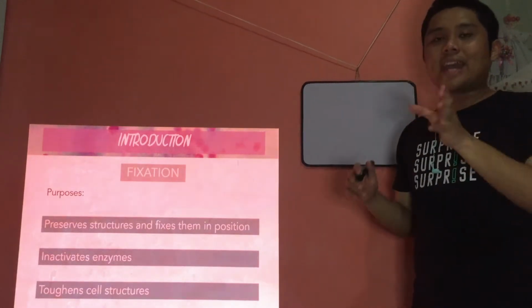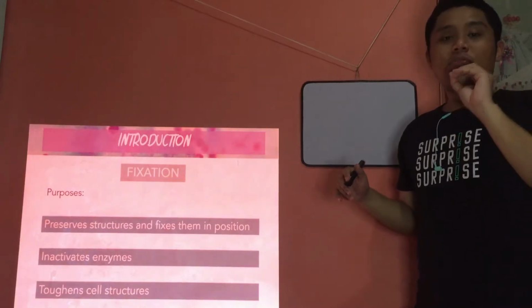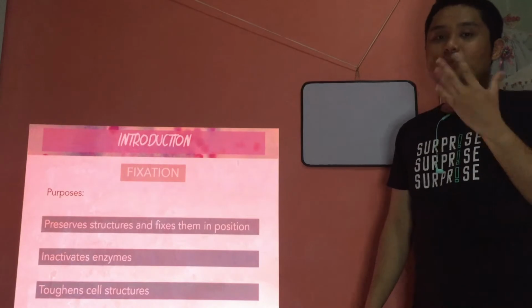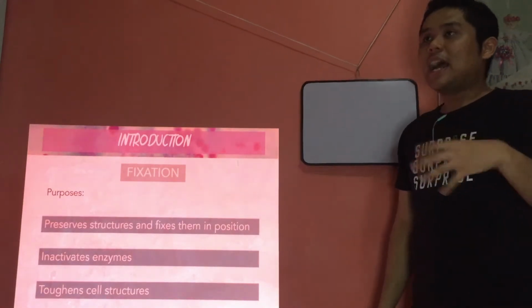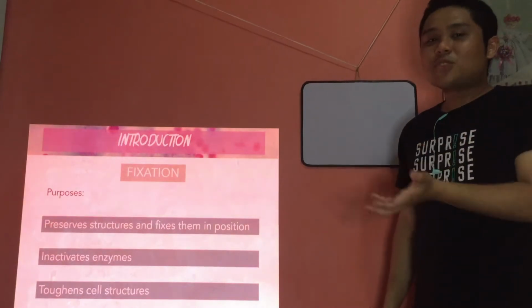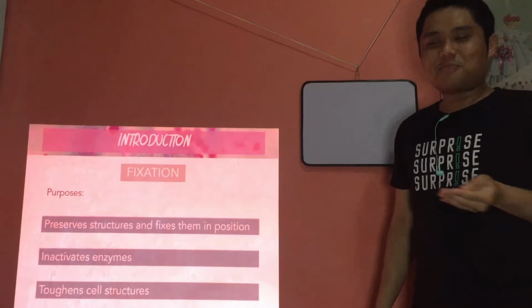So again, very important, I highly emphasize, please do not forget: before you start staining, you must fix it first. Before you go looking for someone that would give color to your life, make sure that you are already fixed.